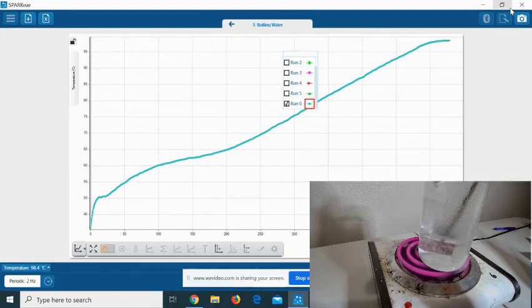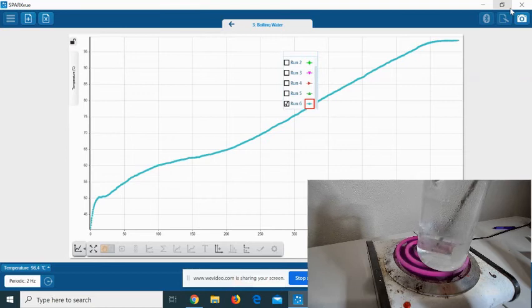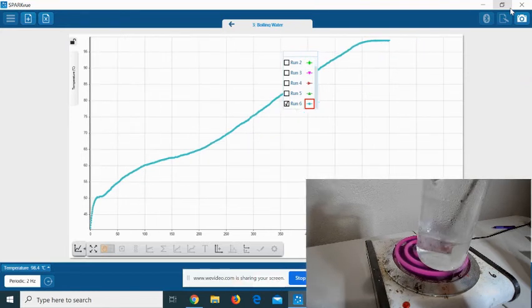And so now you can see that we have a very rigorous boil here. And something that I can tell you right now, the temperature is 98.4 and it is not changing at all. Something I'll tell you while we're waiting for it to boil a little while longer is, remember back in the very first experiment when we were at negative 2.9 degrees Celsius and we were off just a little bit.